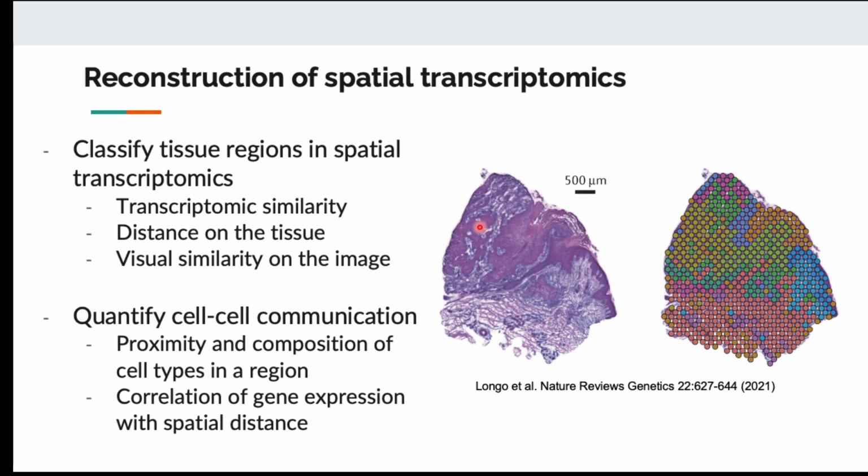But we also want to compare this structure of the yellow cells with similar profiles to their position on the tissue. Do they form the same kind of tissue texture, or do they change, or is there any other type of cells that infiltrate into that region? We want to compare both the omics data and the visual data.